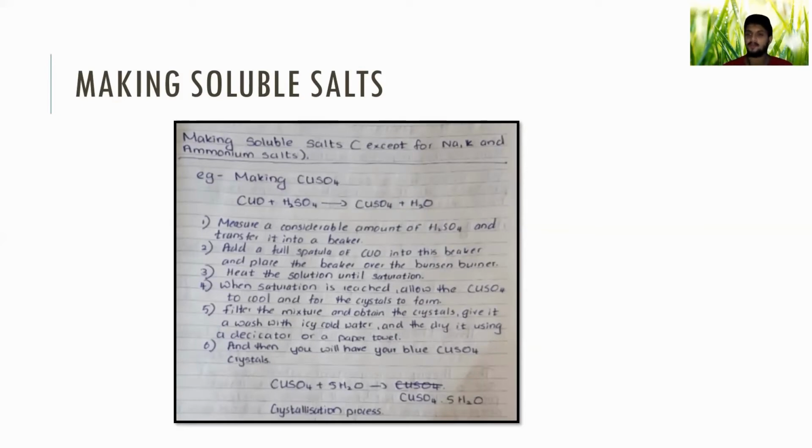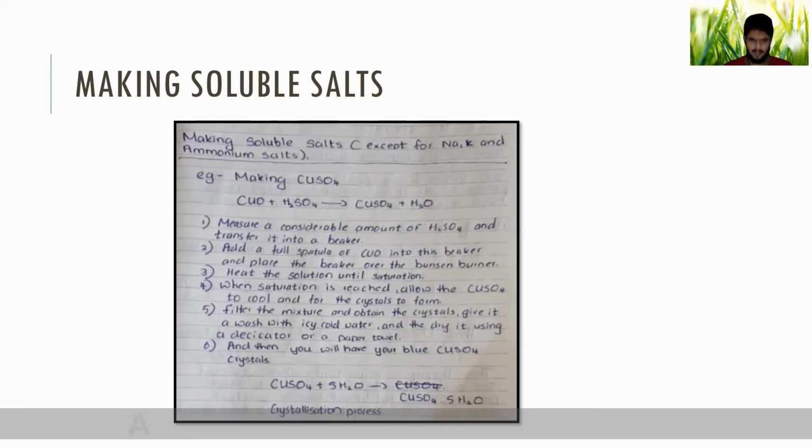A spatula is equipment that we use to grab certain elements when they're in powdered form. It's like a spoon, but in the lab we refer to it as a spatula, okay?